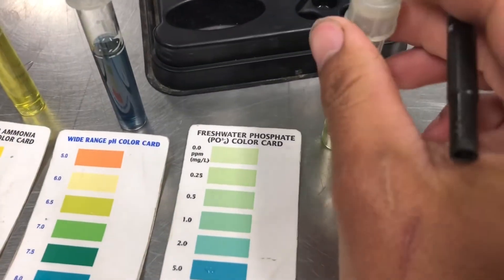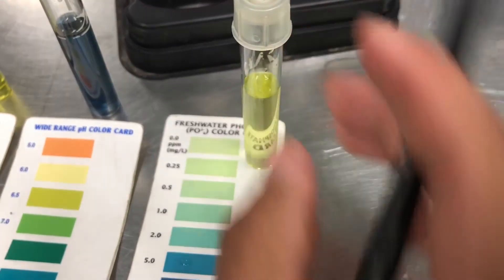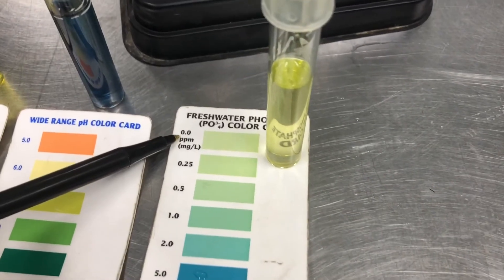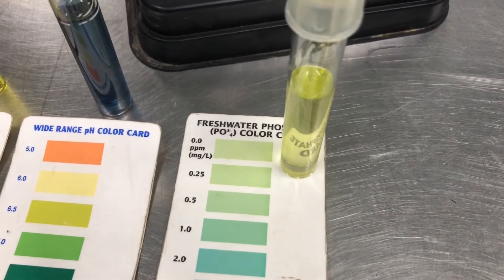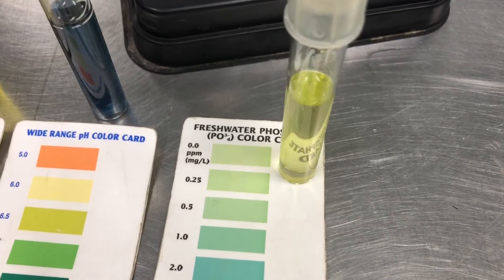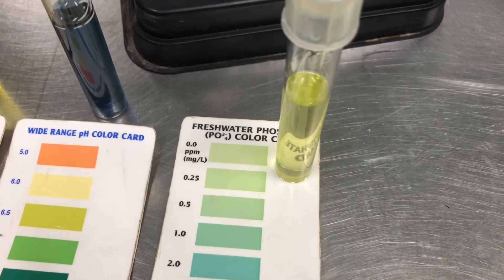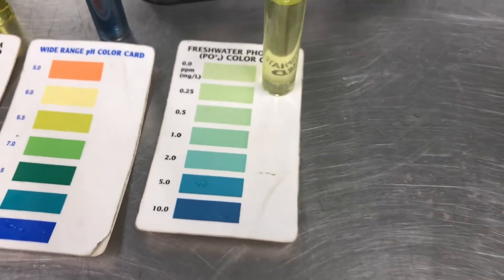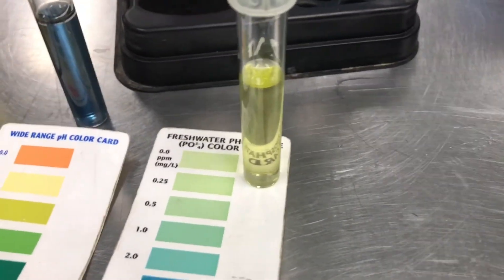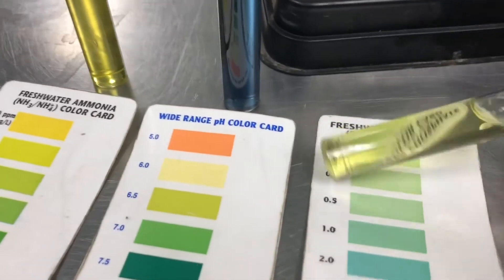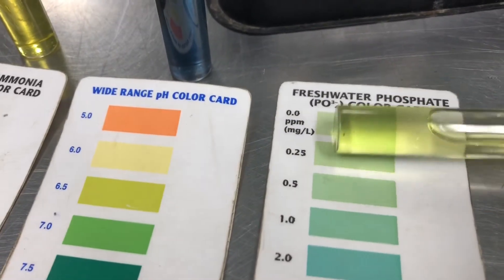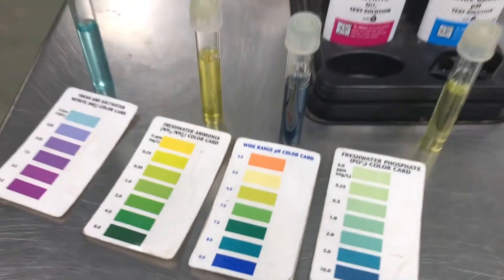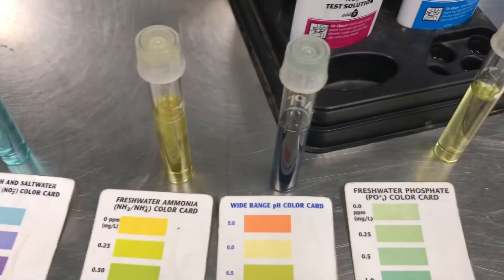And our last test here is your phosphates. Again, phosphates closest to zero as possible. Phosphates, you know, I'd say anything that's the first two or three are pretty okay. But when you start getting into the, you know, the fives and the tens there, that's just getting way too high. So, and you can kind of see this one's, this one's on the lower chart. So, water looks pretty good other than the pH.